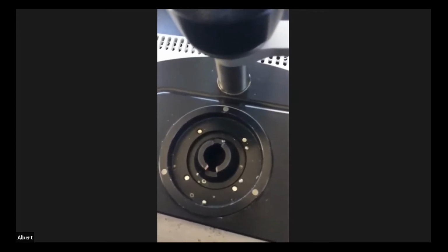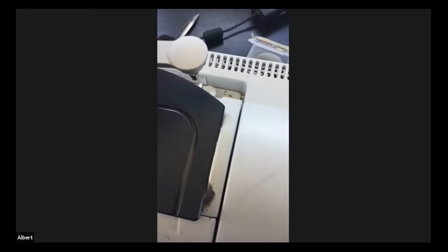There's an aperture there, and that's going to irradiate the sample. Well, let me take that back. There's an aperture here, but the radiation is going to come through the tip. And the tip is going to come in contact with the sample. And while it's bombarding the sample, the functional groups that are going to absorb whatever wavelength hits it, those are the functional groups that are going to show up in the actual infrared spectrum.